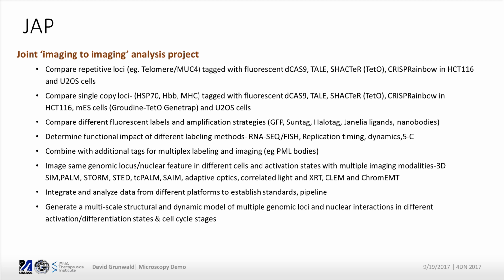Now, there are many, many aspects to best. Some are about, is this label suitable and doesn't interrupt the cycle or the process we're looking at? Another one is, which one gives us the most information? Which label gives us the best image? Here's a problem. How do we know? Is there a metric? Is there something that we can say, oh yeah, we just take this image and we run it through, and then we know this image is better than that image, right? Would be nice if we had.